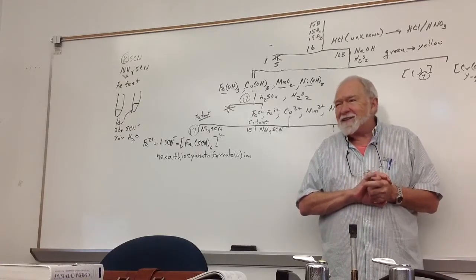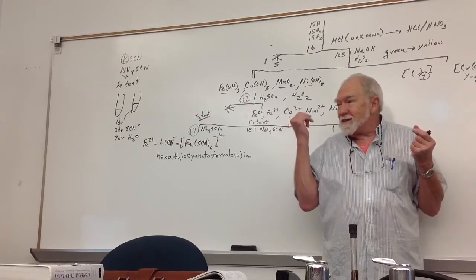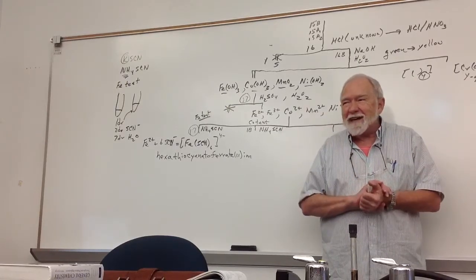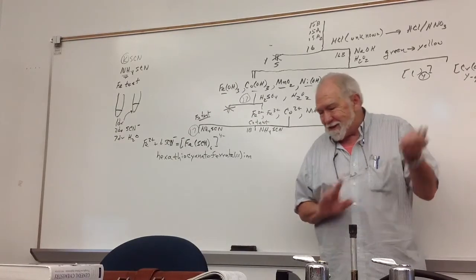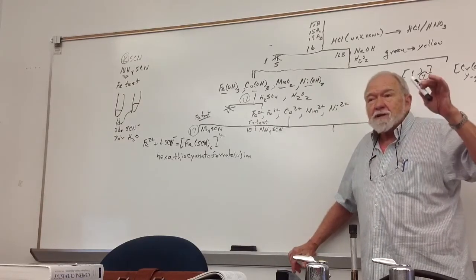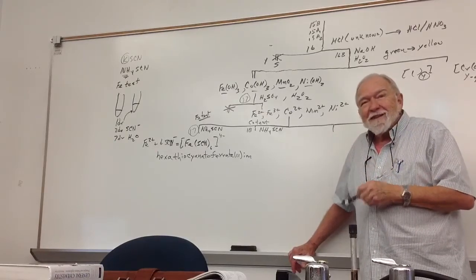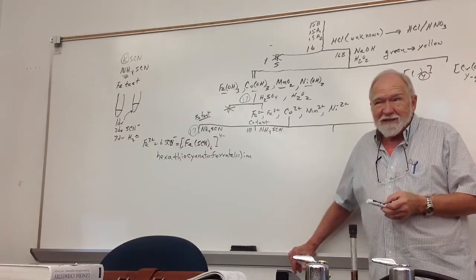I figure if you find ions in distilled water, you're in trouble. So you'll have at least 1 at the low end. This one has 7 different ions, 7 at the high end. Chances are, somewhere between 4 and 7, you have the highest probability of how many ions you're going to have. Right? So somewhere in between 4 and 7, like 3 or 4, is a more likely thing. Same thing for procedure for experiment 2. There are 8 ions. I might have 1 sample with all 8 of them in, and I might have 1 sample with only 1. But most of my samples have between 3 and 5 or 3 and 6.